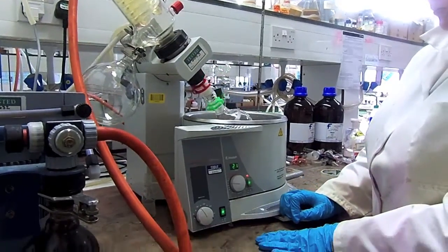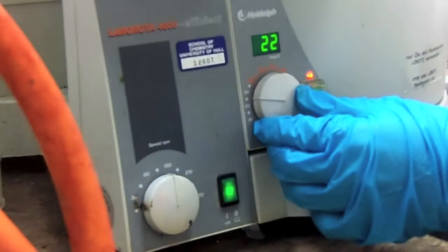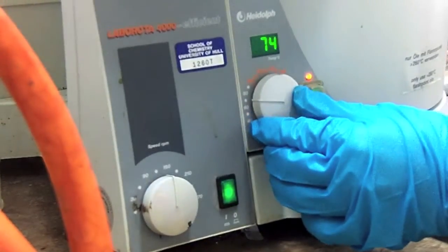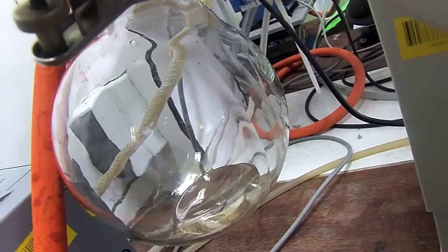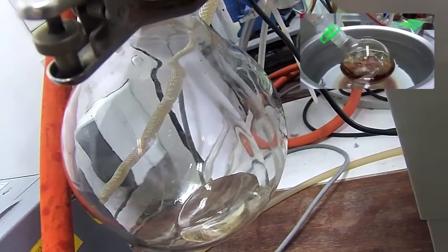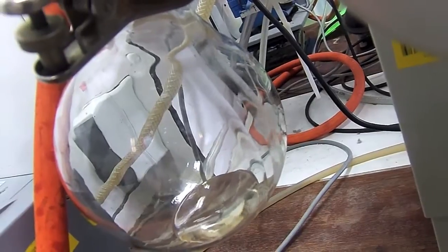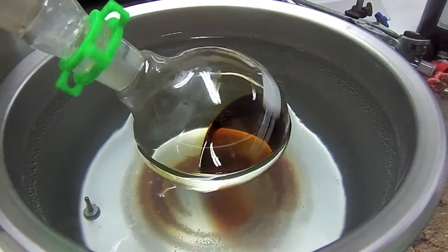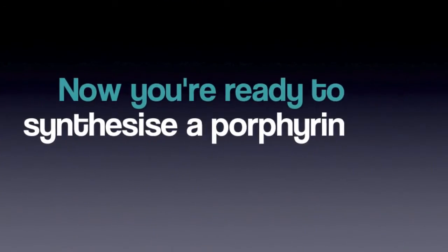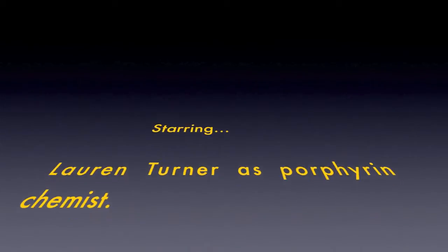Adjust both the spinning and the heating of the rotary evaporator so the spinning is around medium and the heating is around 60 degrees. You should see the clean pyrrole collecting in the collection flask, while the brown pyrrole that you put in will slowly evaporate until there is nothing left — this is when you can stop the distillation.